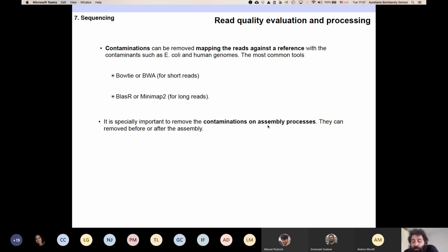When I started doing bioinformatics, we were analyzing some tomato samples of a researcher from Florida. So we received the samples, and when we mapped the samples against tomato, because we were working with tomato, only 20% of the reads mapped. And that, of course, is a disaster. You always are going to have contamination. A range that you can survive is, let's say, 30% of contamination at most. If you have more than 30, it's because you have a big problem. So, of course, we could map only 20%, so we have 80% of contamination.